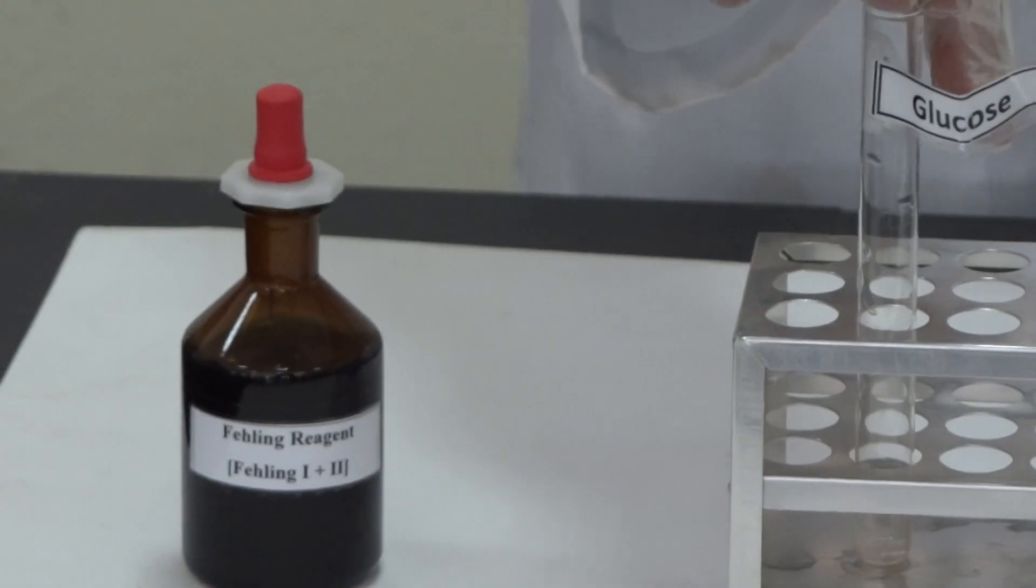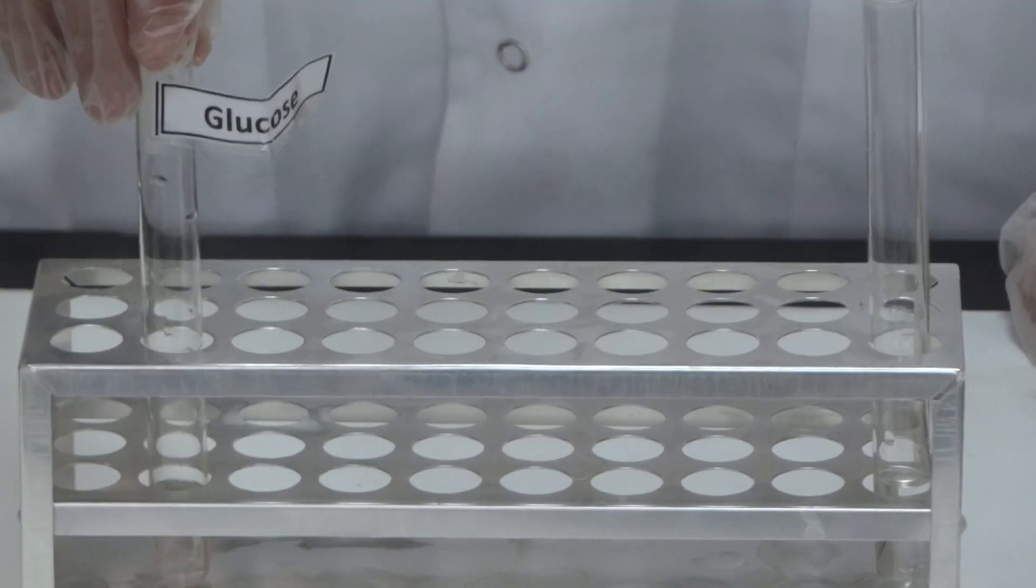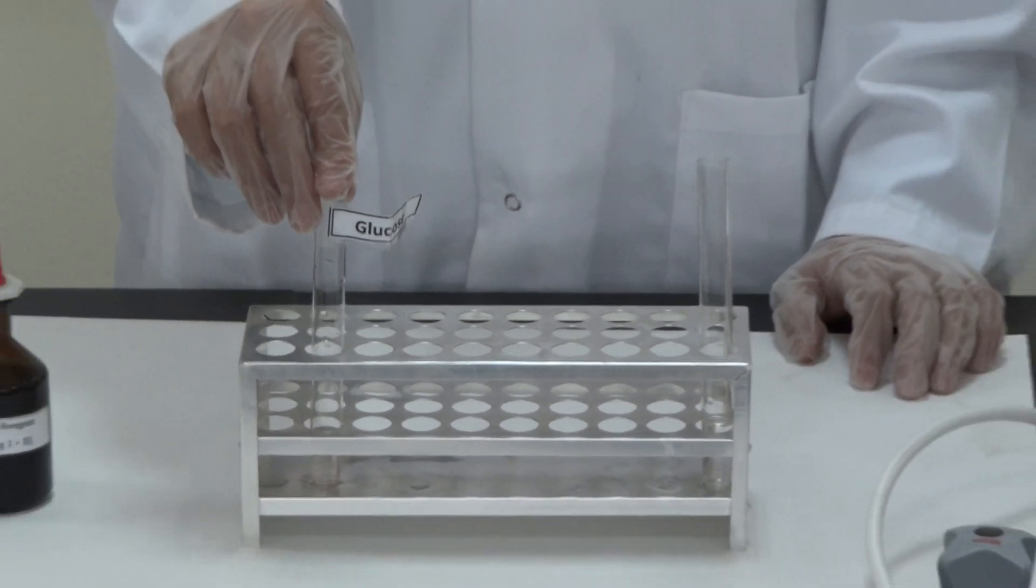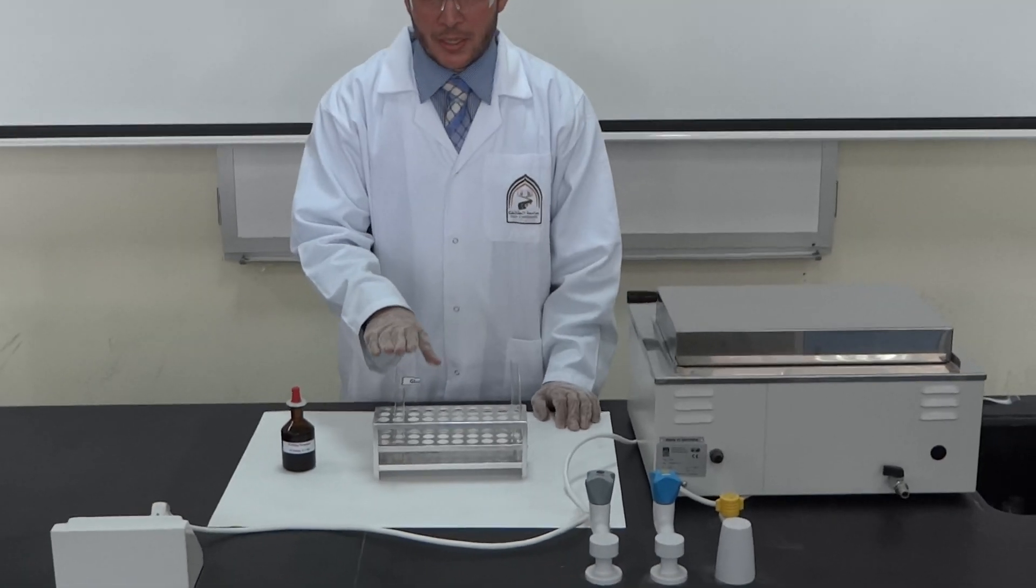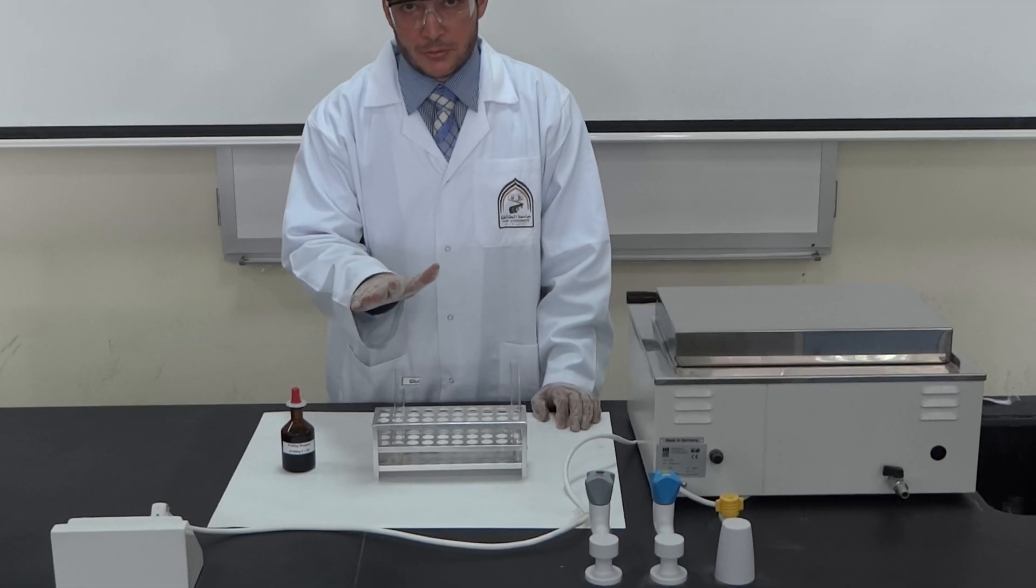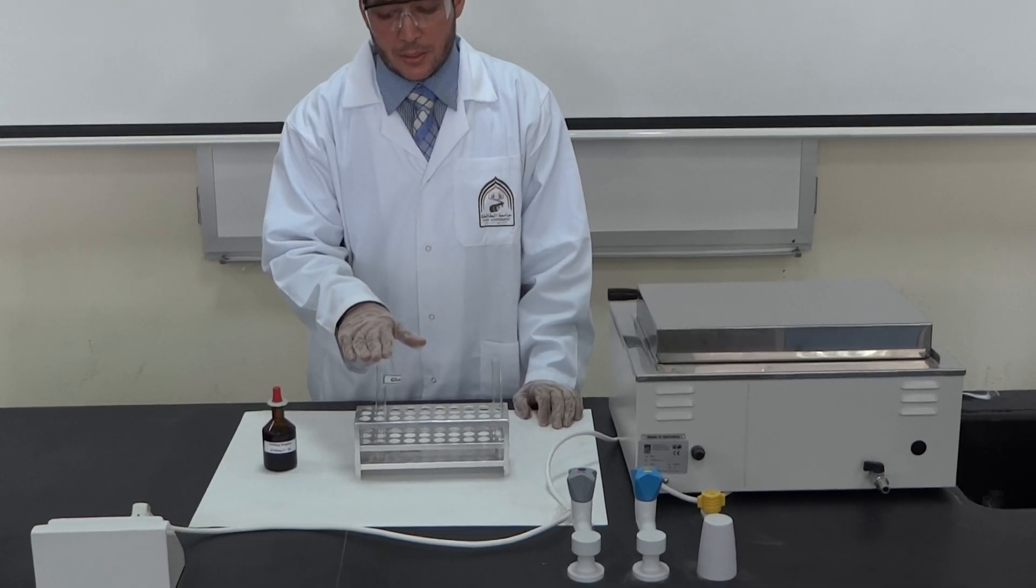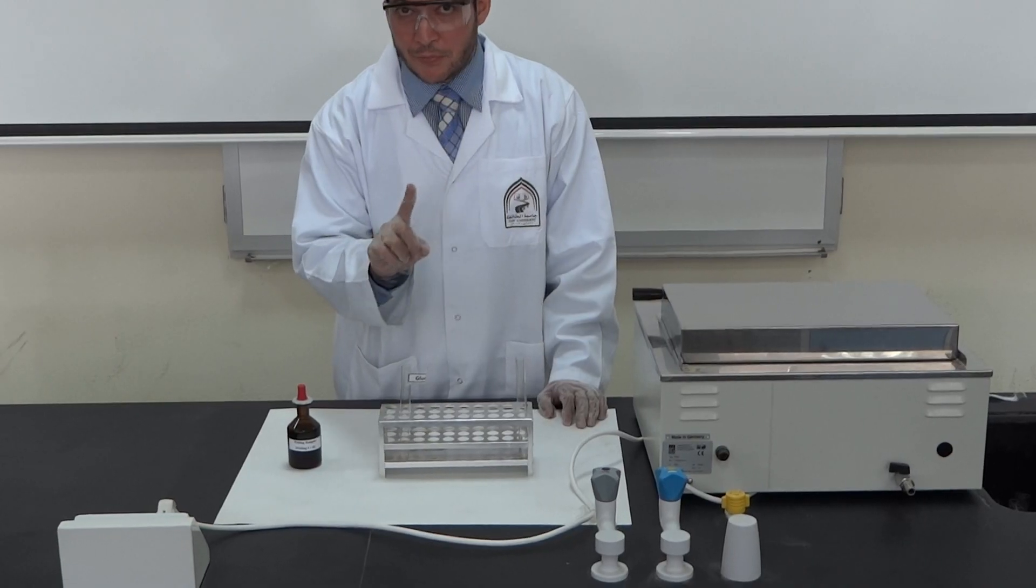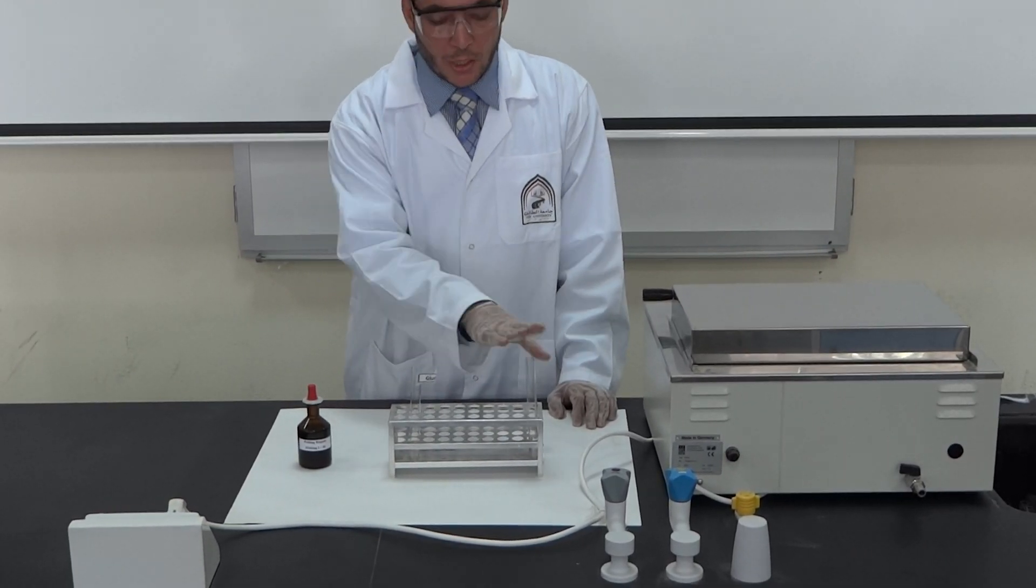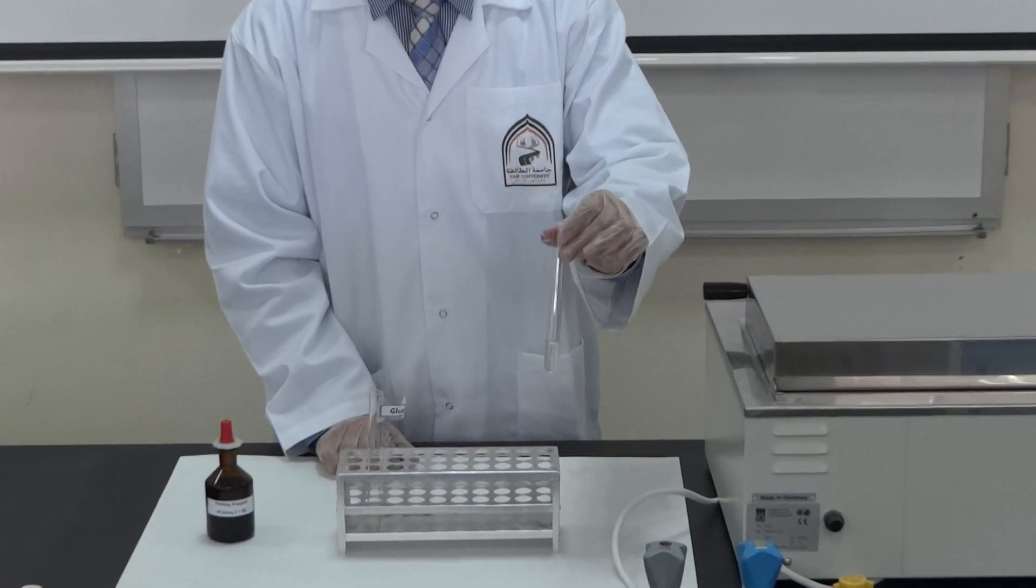As an example of reducing sugar, we have glucose, which has a free aldehyde group and is one of the family of monosaccharides. Similarly, we get the same results with glucose, fructose, and galactose as monosaccharides, lactose and maltose as disaccharides, but we won't get positive results with sucrose, although it is a disaccharide. We get negative results with sucrose or anything else.